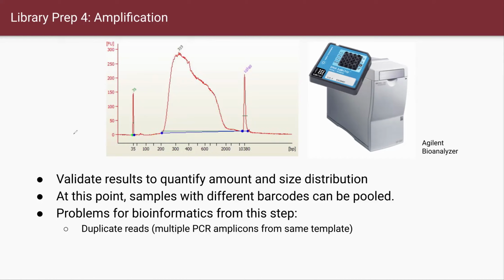Another thing you have to keep in mind, as I mentioned, is that we're not doing the PCR enrichment, PCR amplification, these days anymore, because the adapter ligation efficiency is getting better, right? And we don't need it. Especially if you have the PCR, then you have the same library many times in your samples. We call these duplicate reads. And we don't need this information anymore because it is very redundant.